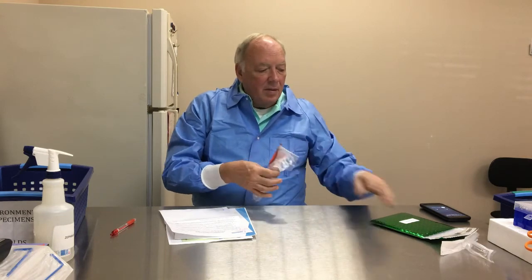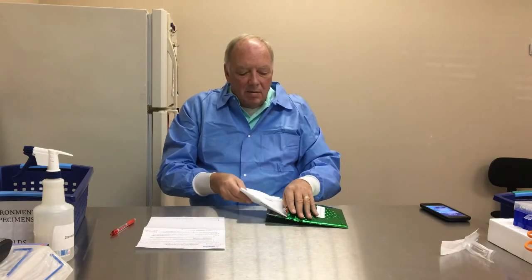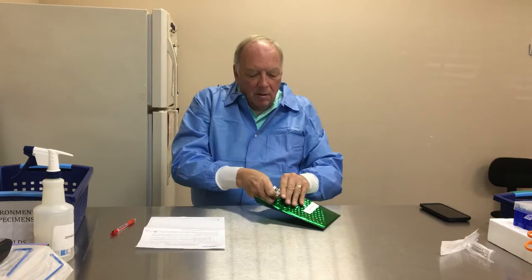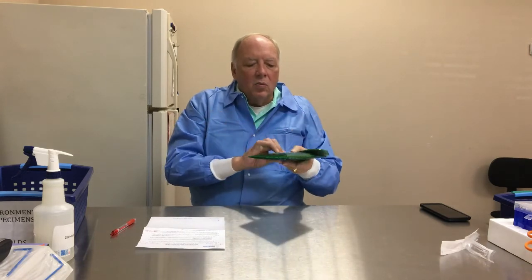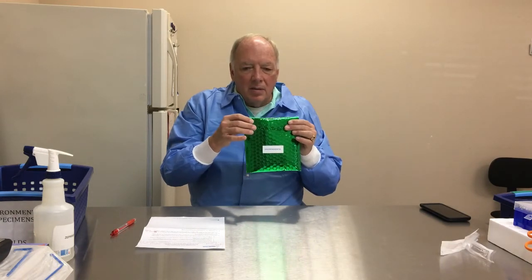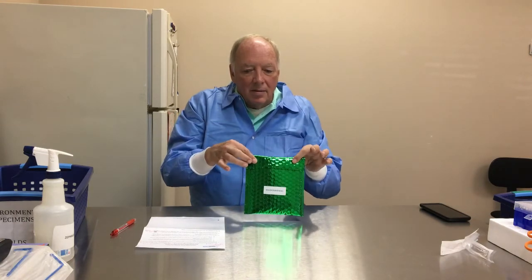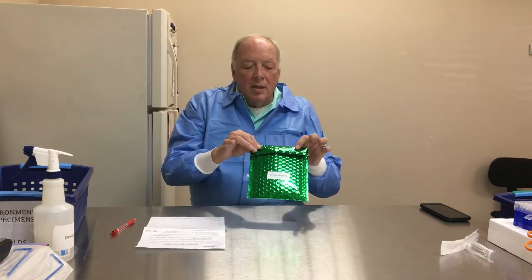Once you're all done, fold the swab and put it back in the kit, then fold up the completed paperwork and place it in the kit as well. Seal it so it's one package, then use the included UPS or FedEx envelope and mailing sheet — seal it and get it to a FedEx or UPS office or drop box and we will receive it in two to three days.